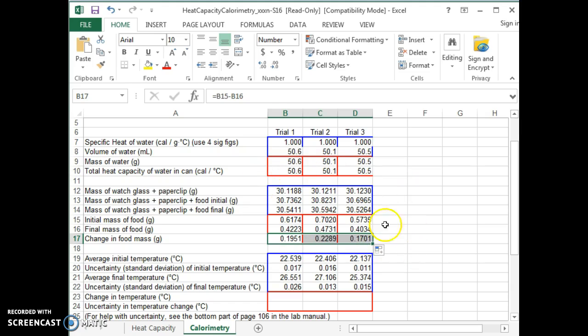Now this is wonderful because it's got 4 significant figures, because when you measure your masses on the balance, you will notice that there are 4 digits after the decimal. And so when you're adding and subtracting, you always want to have the number of digits after the decimal the least, and we should have 4 in each of those. Okay, moving on.